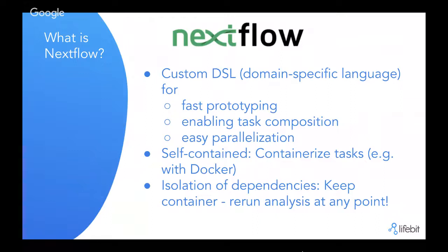You can run multiple of them with loads of different BAM files all in parallel. So rather than waiting for 100 BAM files to execute for make examples one after another, you're just waiting for one, as they're all running at the same time. Okay, so you don't have to worry about the management of the parallelization, with as much data as you need. That's just taken care of for you.